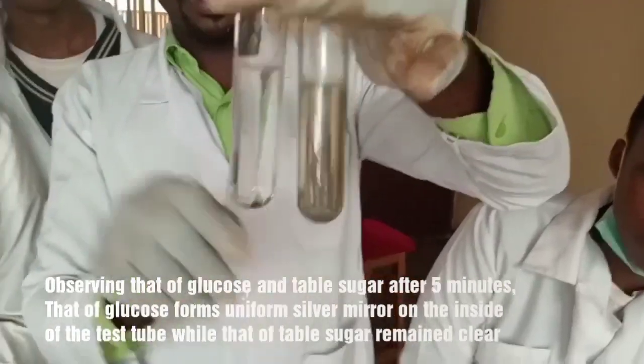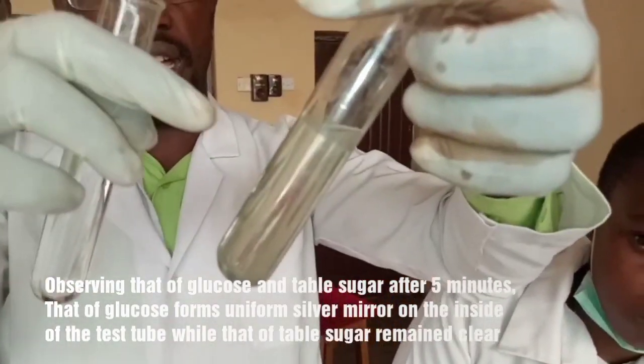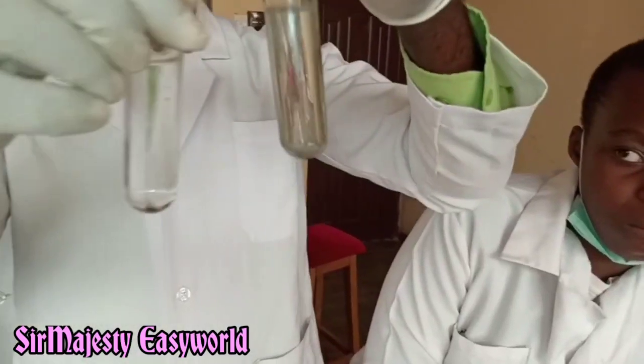This is the silver mirror. And this one didn't form any silver. You can see there is silver metal covering the inside of this test tube. So to make it more visible, we should put it inside this.